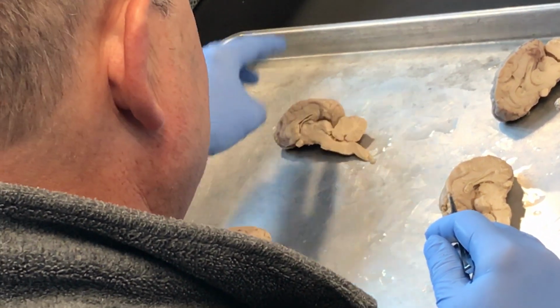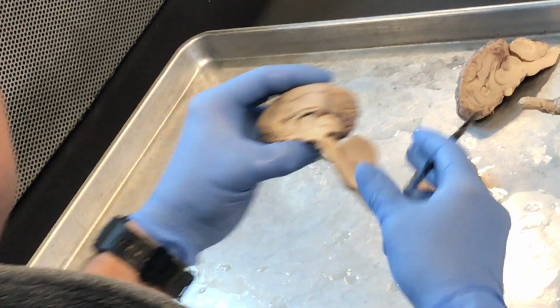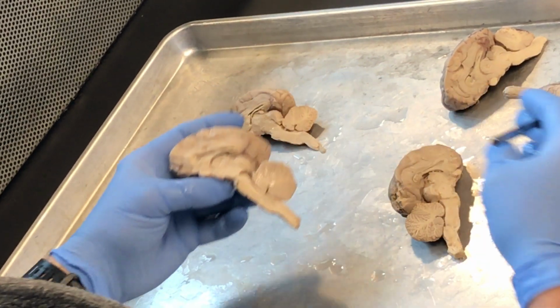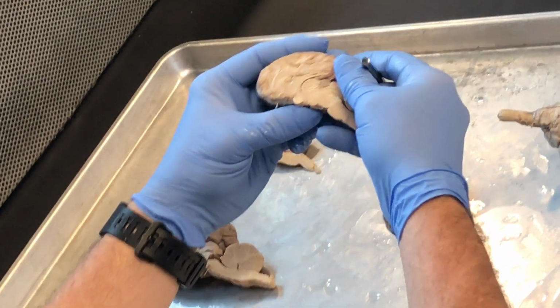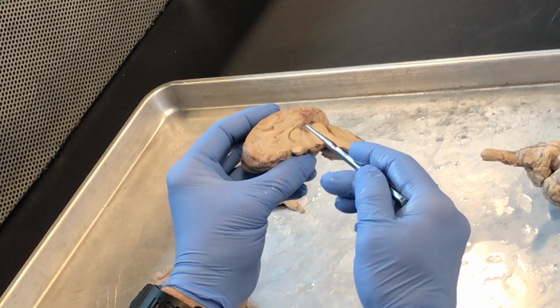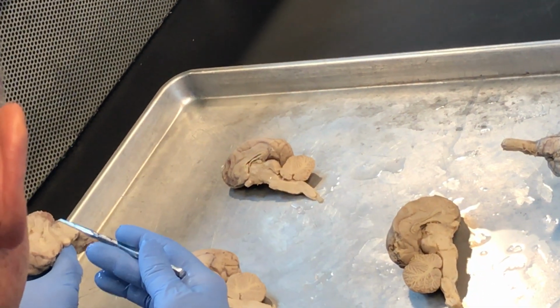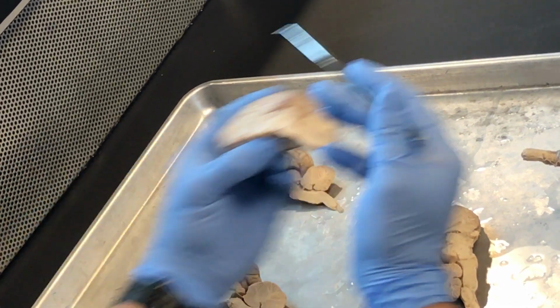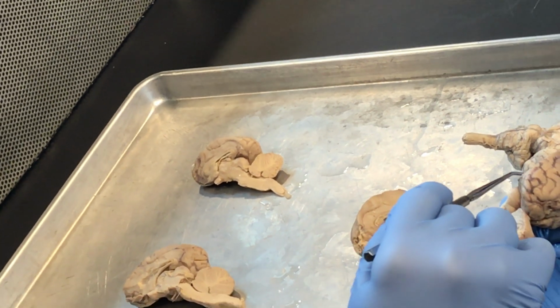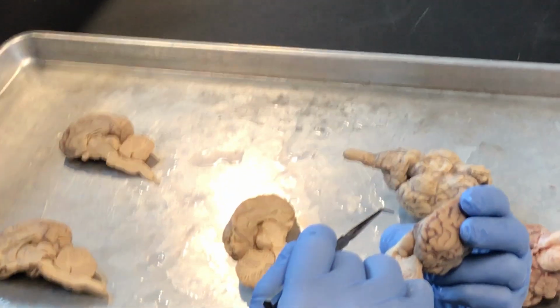Let's go back to that one that I was showing y'all. This is the one, we'll use this one, probably better. So remember we said this is the intermediate mass of the thalamus? We said this is the optic chiasm. We said hypothalamus is right here. Intermediate mass of the thalamus, optic chiasm, and hypothalamus was right there, correct?